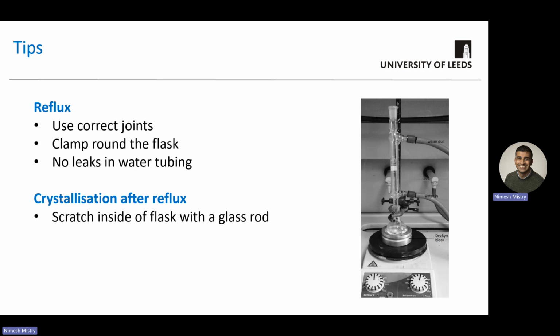If you clamp around the condenser and you then try to lift your reflux apparatus, well then you'll lift your condenser, but your round bottom flask will just simply fall off the bottom, and your solution with it. Your reaction, which will be hot, will fall off the bottom, potentially break the glass, and then you've got hot chemicals that have been heated, but with nothing to keep them contained.